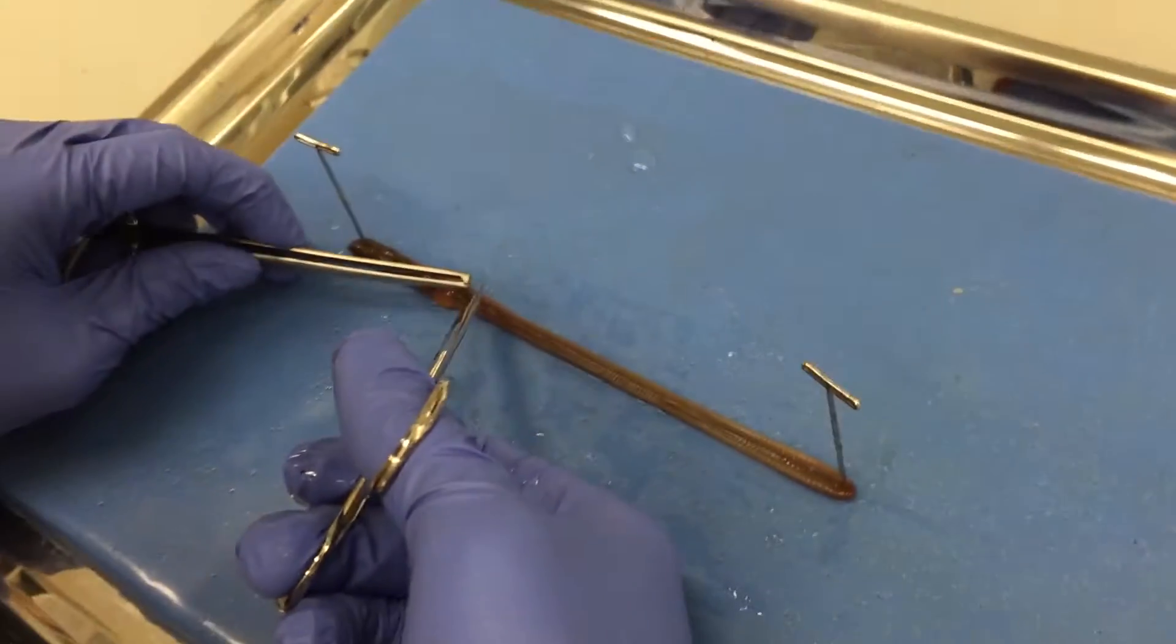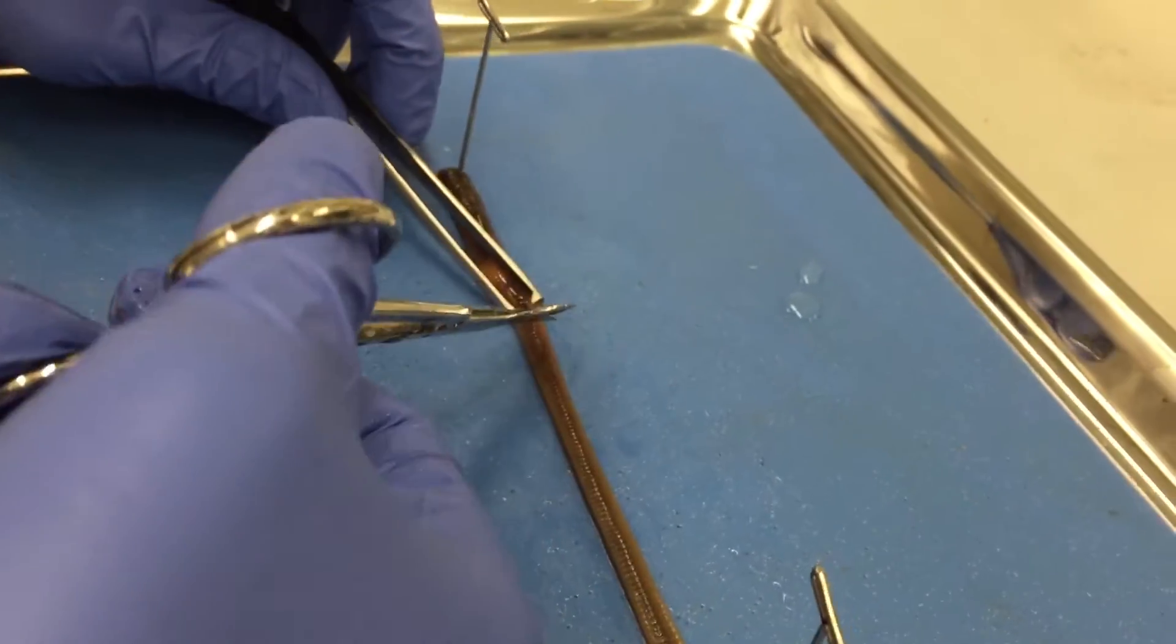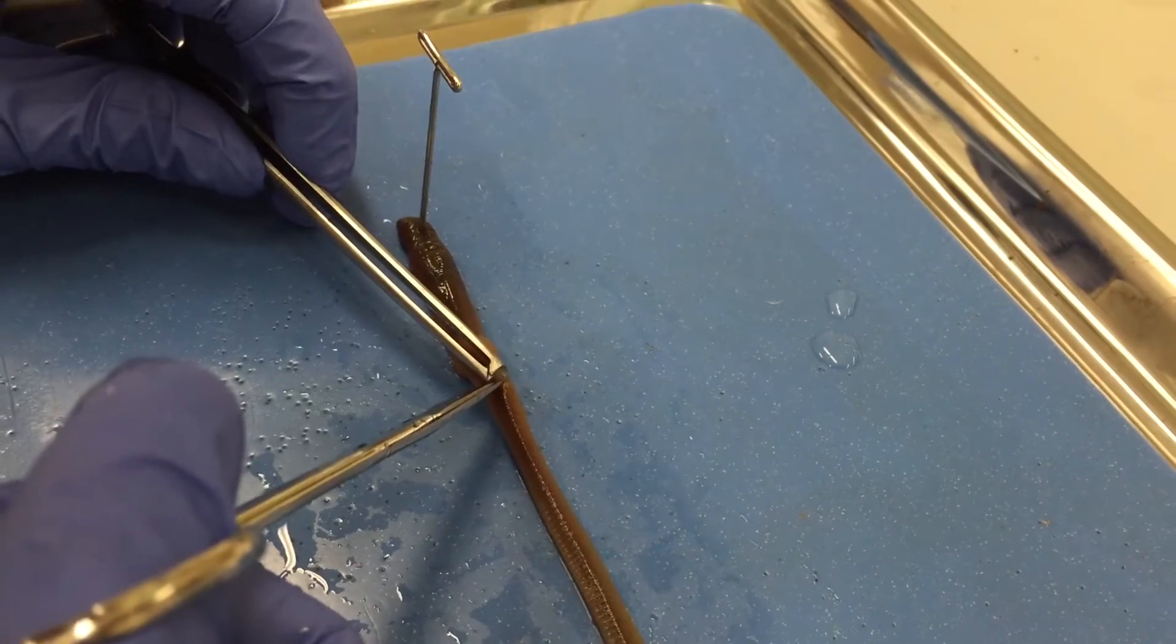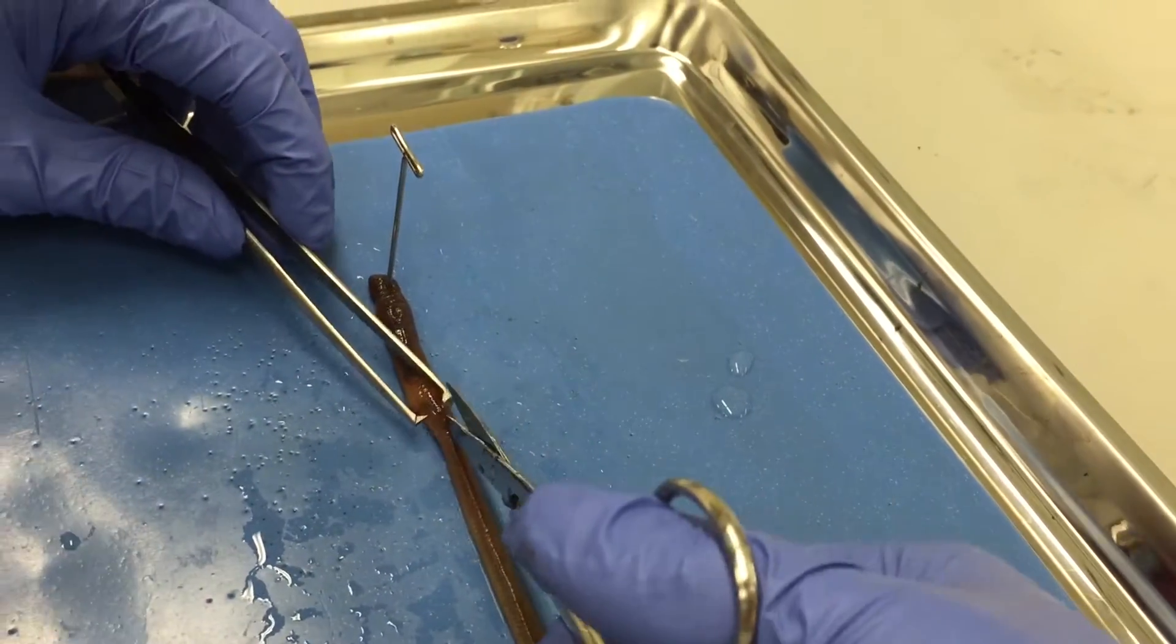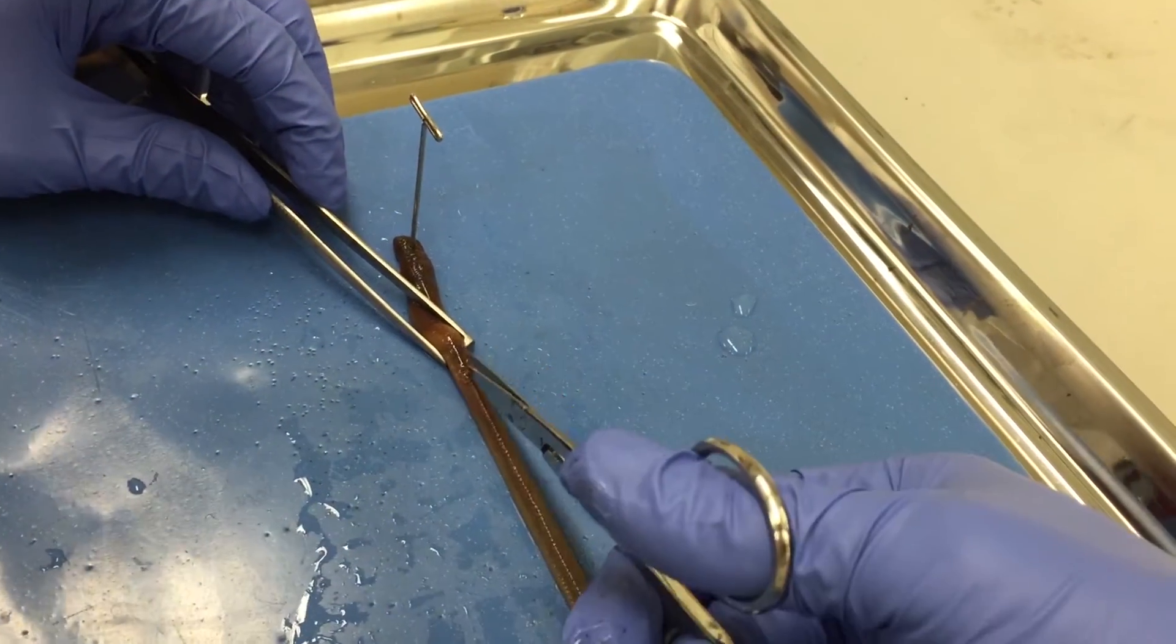Using the rat tooth forceps, carefully lift up just the skin below the clitellum and make an incision with the scissors, being mindful of not damaging any innards or the intestine.